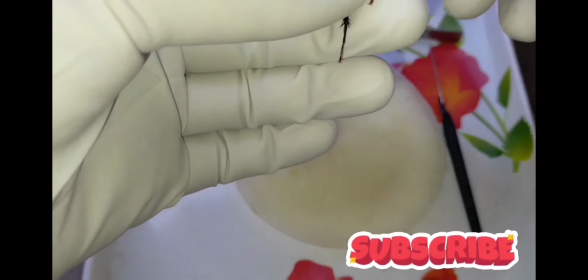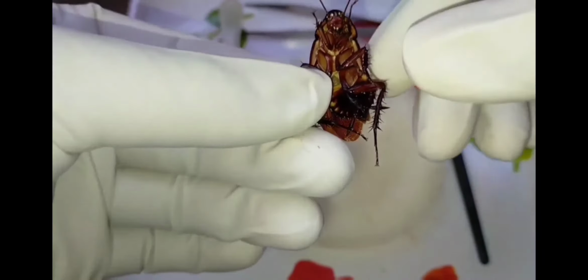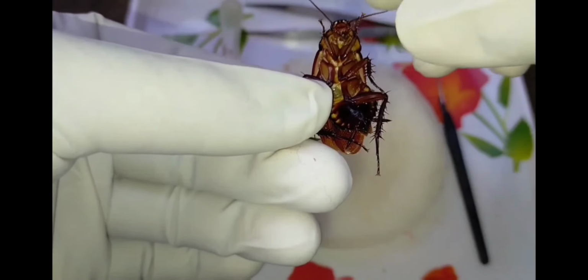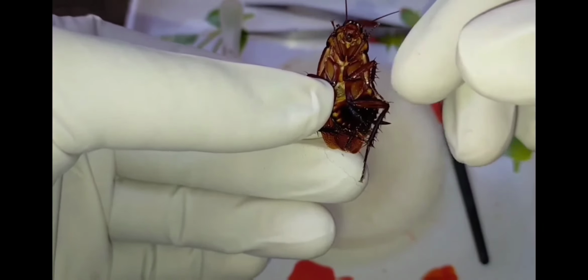Now the thorax part. The thorax is divisible into three: prothorax, mesothorax, and metathorax. Each thorax segment gives rise to a leg or appendage. The two near the head are the prothoracic legs. The middle pair is known as the mesothoracic legs, and the last pair, which is big in size, is the metathoracic legs.